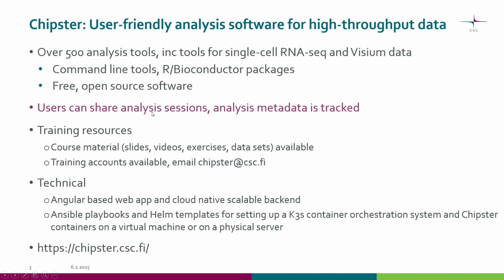It has certain useful features. For example, you can share your analysis sessions with a colleague and the analysis metadata is tracked. So Chipster remembers for each file which input file you used, which analysis tool, and which parameter settings.